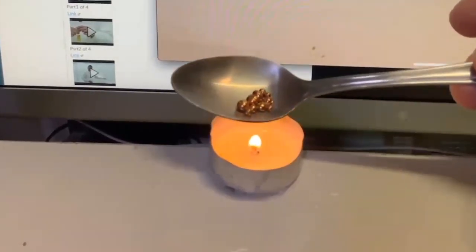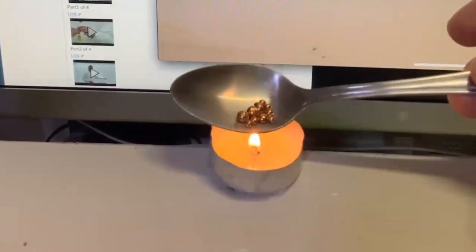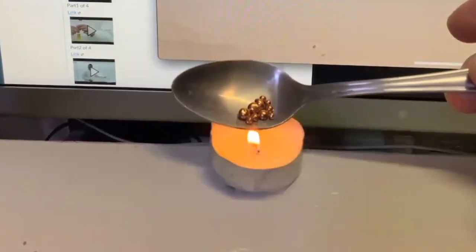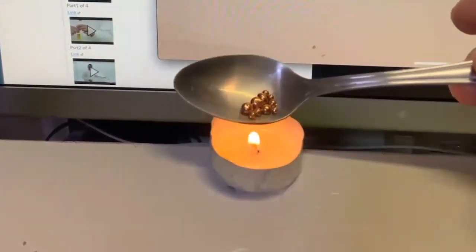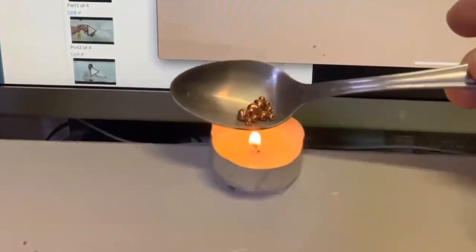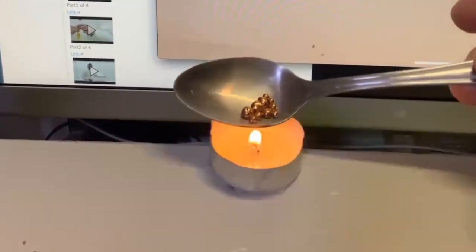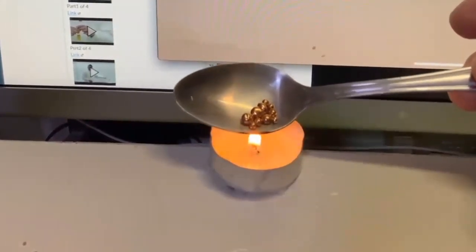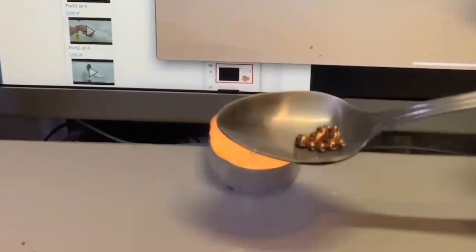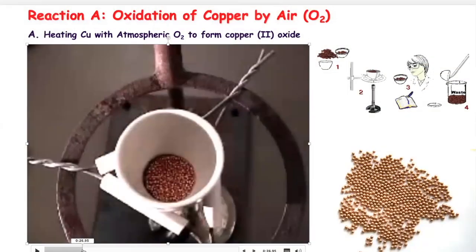And if you've got a stand, just let it sit there for about 5 minutes. But if you look closely, some of the copper is already getting discolored. So make it go for maybe 10-15 minutes so that you can actually see something going on. So that's what you would do in this particular procedure. Okay, so I'm going to put this down. So this is basically this reaction.